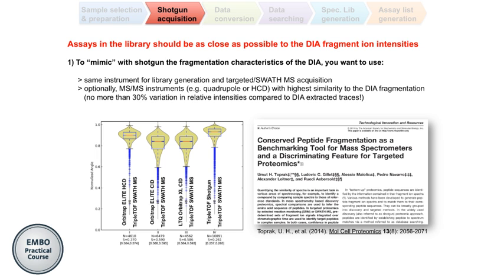But if you're interested, we try to describe this in this paper. This is comparing the intrinsic reproducibility of the machine in terms of fragmentation. So how reproducible is my machine for fragmentation? How transferable is my assay from one instrument to another instrument? And it was a master student in our group that developed this.